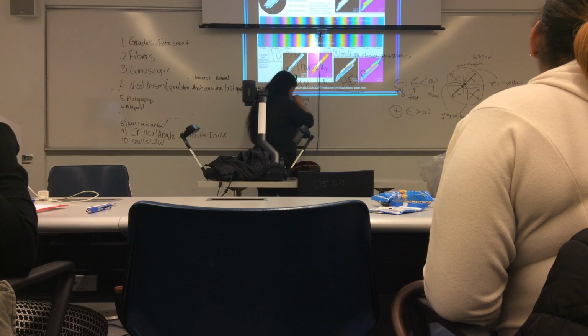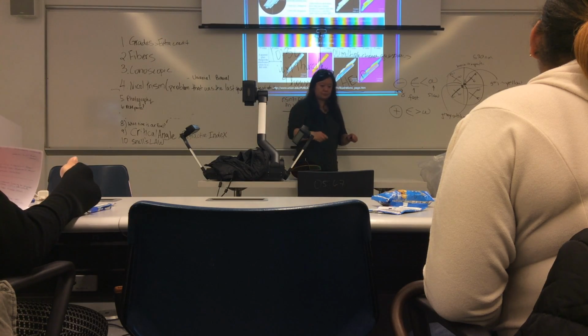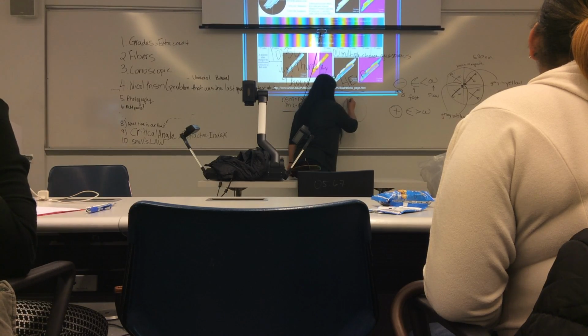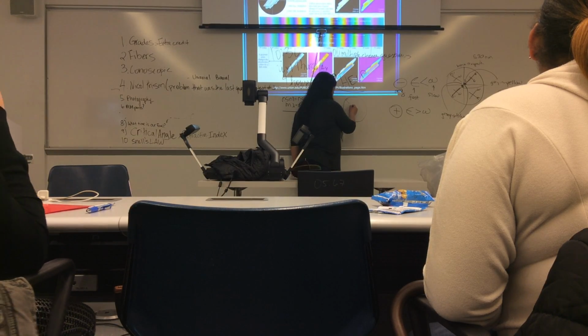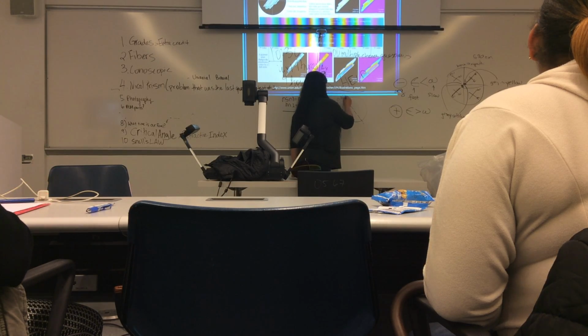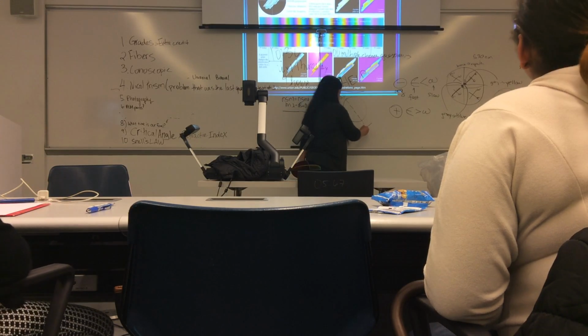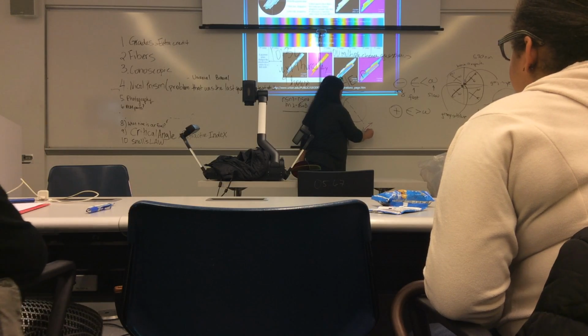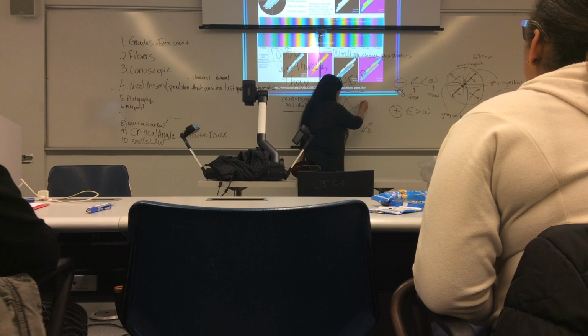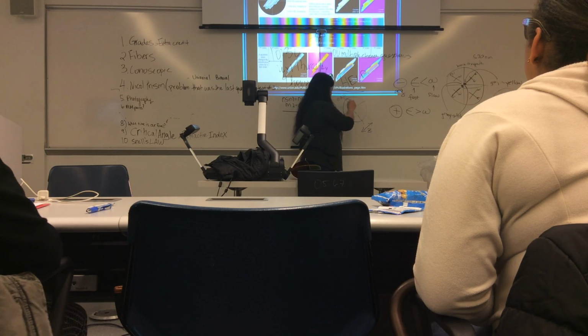Okay. So with the biaxial material, you've got your conoscopic image, and you're going to set it up so that the trace of the optic axial plane is in that direction. Here's the slow ray of my compensator.